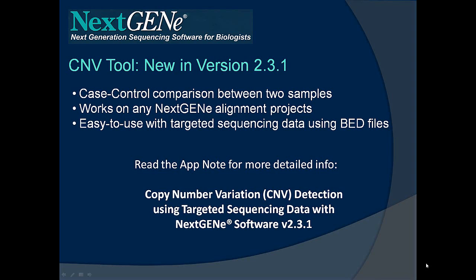The CNV tool is new to NexGene in version 2.3.1. It works on a case-control comparison between two samples, and those samples can be any NexGene alignment projects — there's no special processing needed ahead of time. The more similar those projects are in terms of experimental conditions, the better, in order to reduce the amount of variance that can occur.